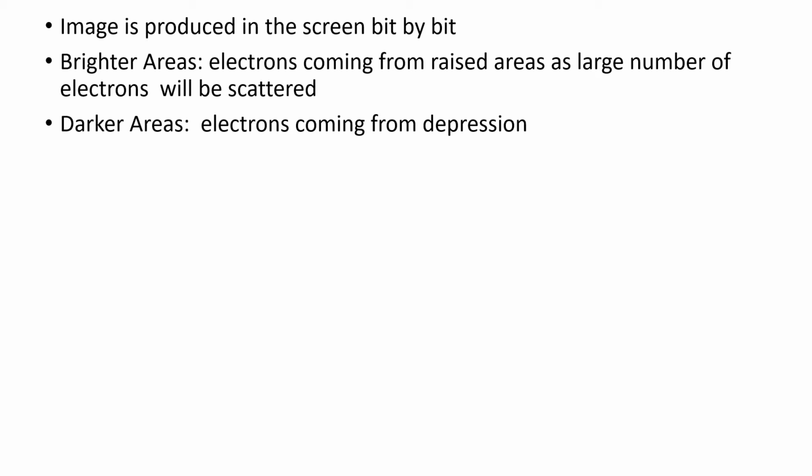As I said, when that highly pointed beam of primary electrons is hitting our specimen, it is hitting only a point on the surface and not the overall specimen. But what do we need? We need to scan the whole specimen. So we will be using scanning generators.